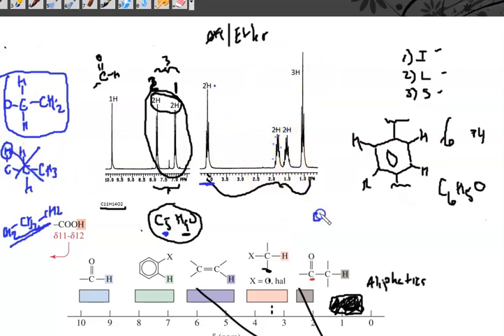And then we have this one, which is a CH2 next door to a CH2 and a CH3. Because this is 1, 2, 3, 4, 5, 6. So 5 hydrogens, CH3 and CH2. And then we have our CH3 attached onto our CH2. Okay, so the molecule, I don't have any more room, but where does the aldehyde fit in? Well, remember there are 2 groups on here. One group is probably the aldehyde, so that's probably our aldehyde right there. And then this gigantic group that has the CH3, CH2, CH2O is hanging off of our ring here.